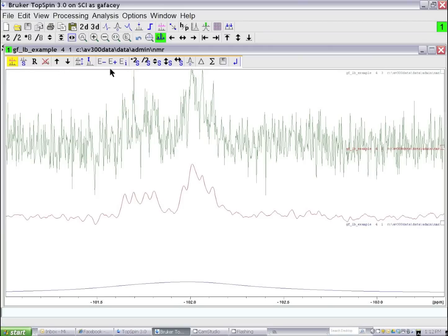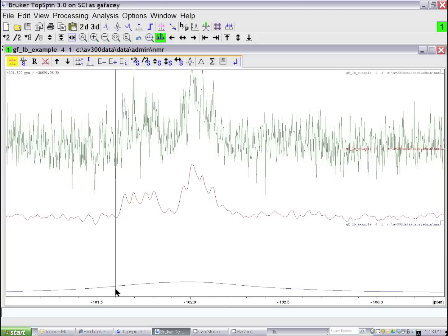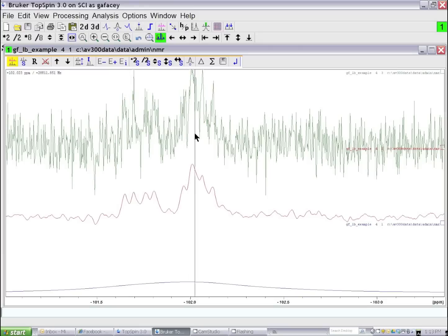And then if we look at the lower trace, it's just broadened out to the point where we don't get any information at all.